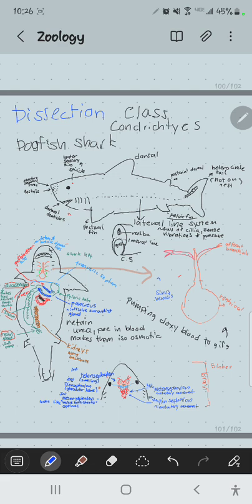So we'll do that. And then your shark boards, of course, will be kind of greasy and slimy. We have industrial soap over there. I'll take all the small trays out so we don't get those in the way. But I'm going to ask you a favor: use soapy water to clean these off, and then you see how they're kind of tilted upside down so they drain, and that way we'll have these available for the frogs, etc. We'll use the other sheets for the frogs, but just to keep them clean, keep the odors down so we don't smell up the whole building. That'd be great.